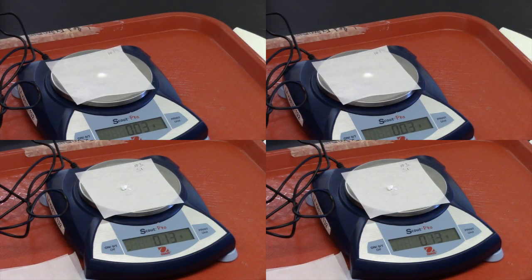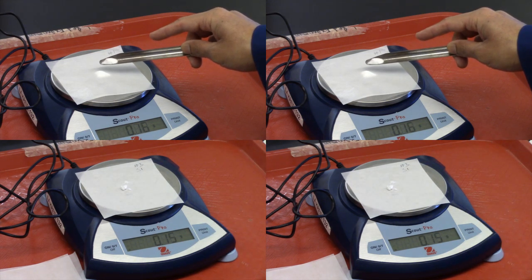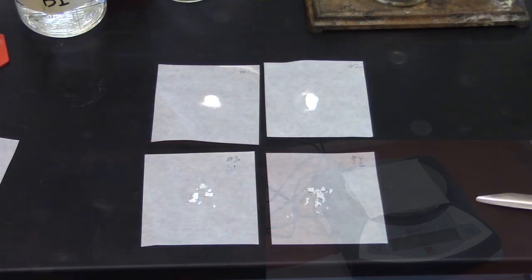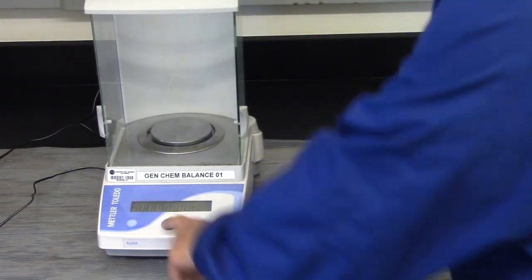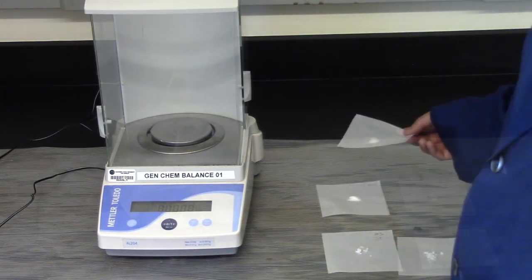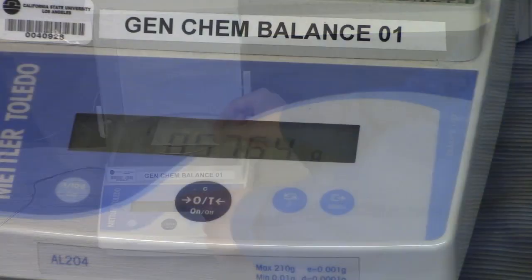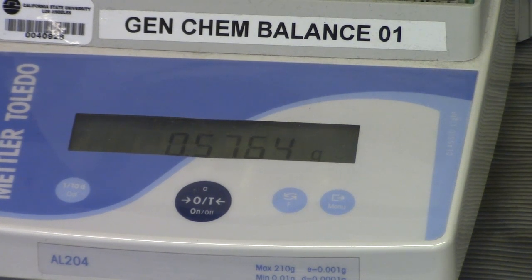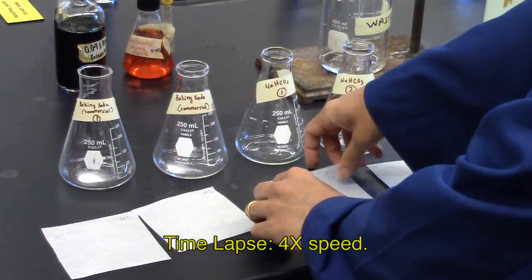Using the centigram balance and its tare function, weigh out on the labeled weighing papers two 0.2 gram samples of the commercial sodium hydrogen carbonate and two 0.2 gram samples of the synthesized sodium hydrogen carbonate. Return to the same analytical balance to reduce systematic errors. Weigh the four samples of weighing paper plus sodium hydrogen carbonate. Record the masses. Transfer each sodium hydrogen carbonate to the appropriate labeled flask.